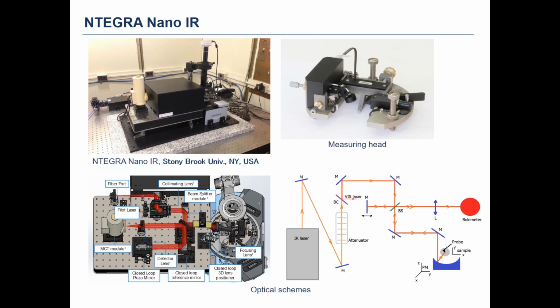You mean the cross noises between the AFM laser and the infrared laser that is used for the scattering s-SNOM signal? Well, first of all, the photodiode detector used in the optical beam deflection scheme is in another spectral region, and it doesn't work in this spectral range, and correspondingly it does not feel it.